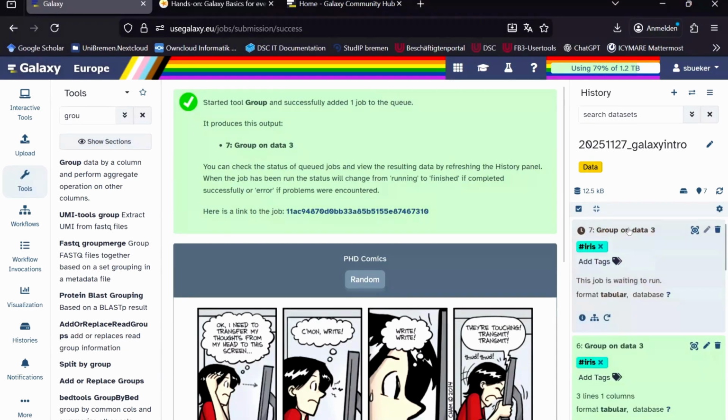It takes sometimes a little bit, and I know that it can be a little bit annoying, especially for such easy jobs, because it's not a fancy thing we're doing right now. It depends on the traffic on the server. But as I said, with the histories and the rerun and everything, we really save time in the end. For your own analysis, you don't have to care for version control or installation of different tools you need. Usually they are already installed. You can rerun everything and it makes it really convenient.